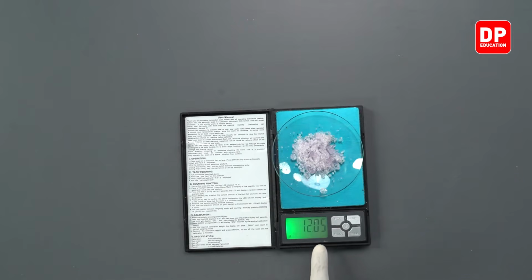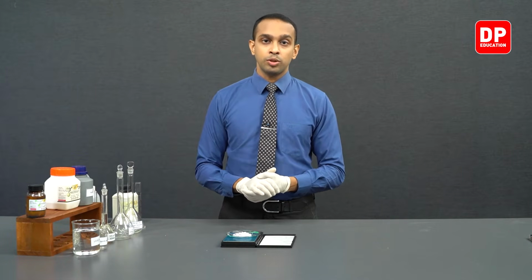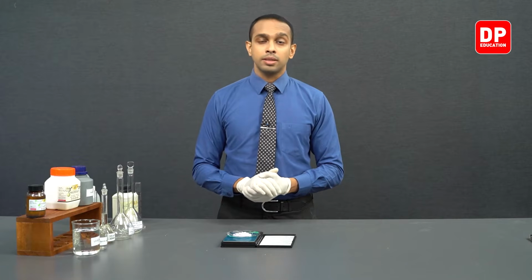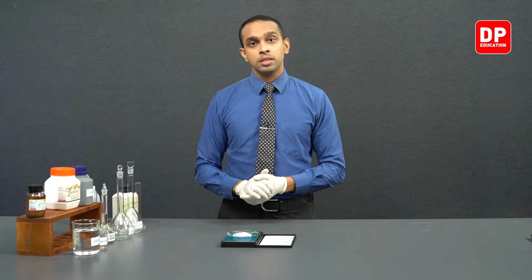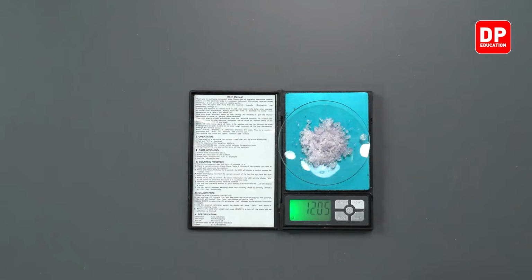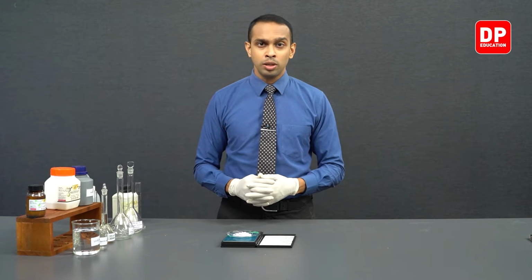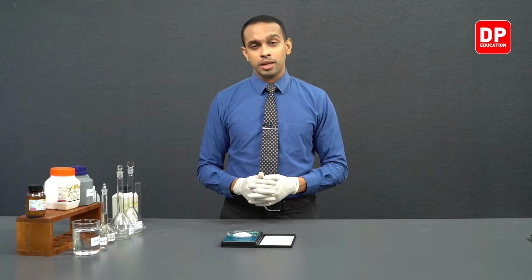Now students, we have measured 12.05 grams. After measuring this 12.05 grams of ammonium ferric sulfate, we have to dissolve this in 1 mole per decimeter cubed sulfuric acid to prepare the solution we want. What we need is a 0.1 moles per decimeter cubed Fe3+ iron solution, but not just any Fe3+ iron solution. We need an acidified Fe3+ iron solution.